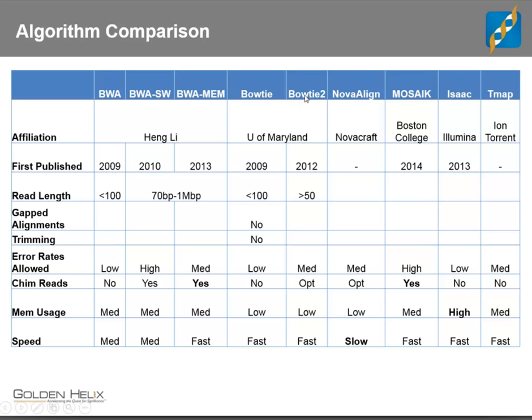Another thing to keep in mind is that Bowtie has been followed up with by Bowtie 2 out of the group in University of Maryland. It's an entirely different algorithm at its heart. It uses a different index. It's also geared for a different type of thing. And in fact, BWA-MEM was much of a follow-up to some of the techniques in Bowtie 2 as well as previous techniques. Bowtie 2 came out first, then BWA-MEM. It's very fast though, and it's very popular amongst those doing RNA-seq.